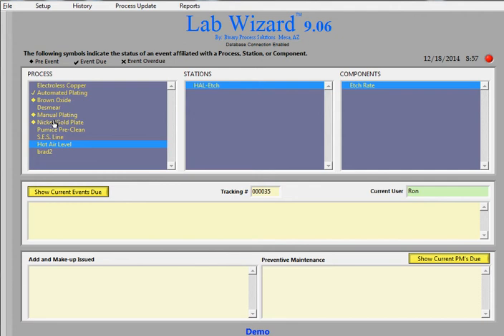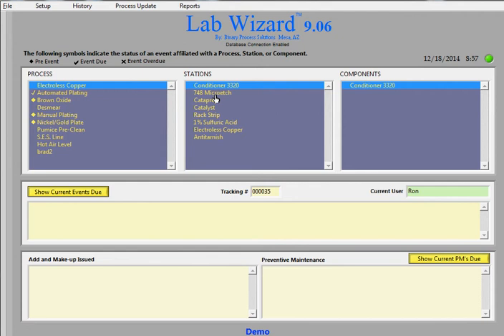And with each process, a set of stations that can be set up. So all these came from one factory doing work. And you can customize any of these parameters with the processes that you have in your production facility.